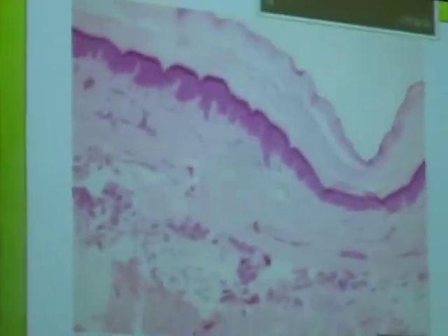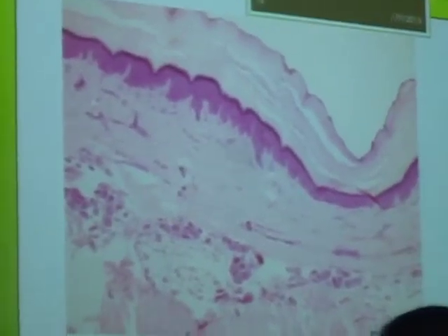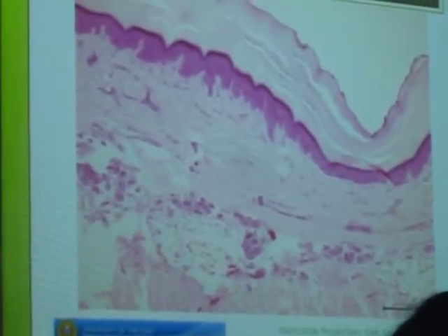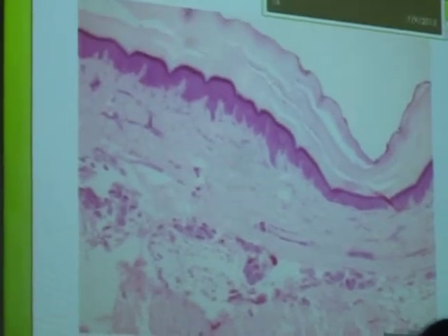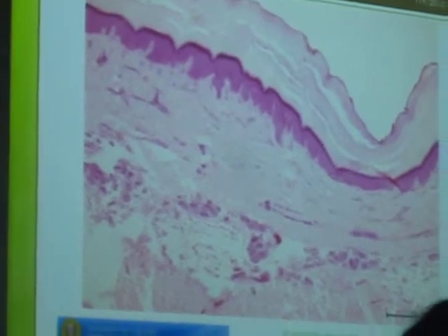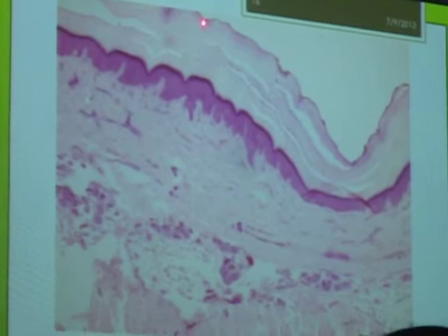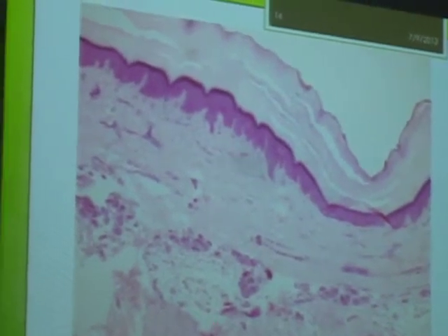Identify the whole organ. Skin. So it's obvious it's the skin, even though you don't have the other appendages. You see, why do you say it's the skin? Because you can identify, in general, you have two layers of the skin. This layer and this layer.